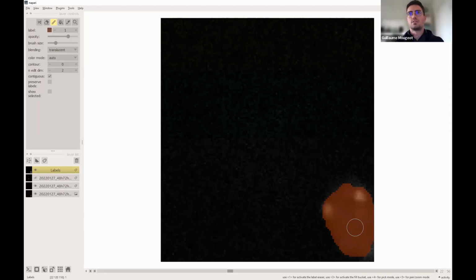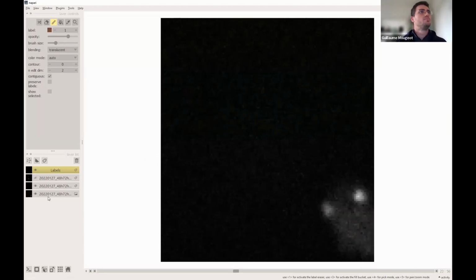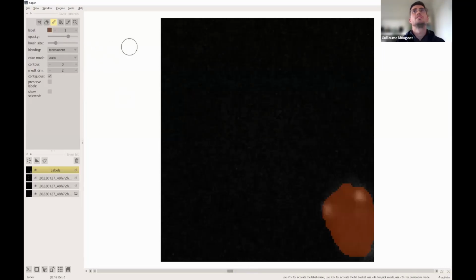And you can go to the next slice. Right. So erase this. Here we go.